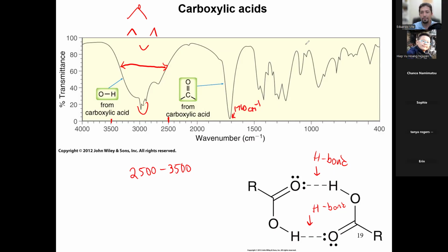I'm not sure what you mean. What was the other bond you needed to look for? Because you need to look for two, right? If you have a carboxylic acid, you have to look for the hydroxyl and you have to look for the carbonyl.